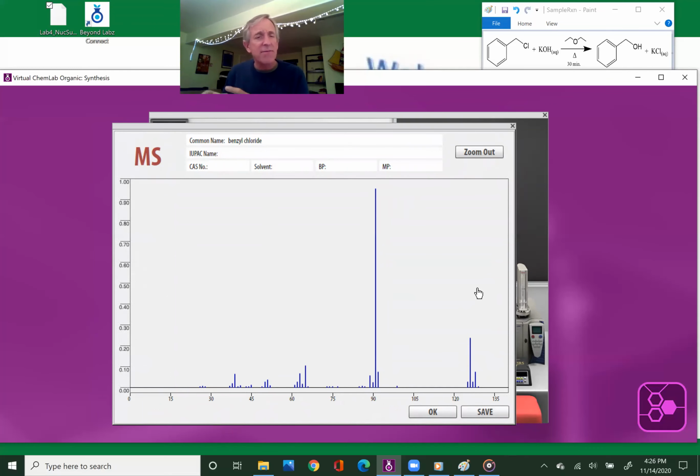I want you to save this in your Google document that you're sharing with me. So please use a snipping tool on PC or print screen and crop it, or use any other way to get this off Beyond Labs into an image that you can then put in your Google Doc and share with me.